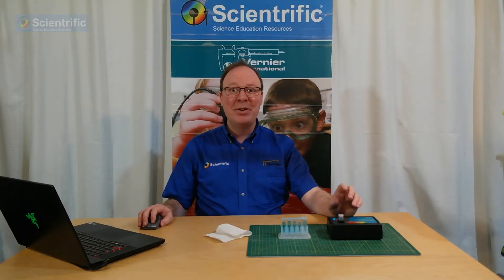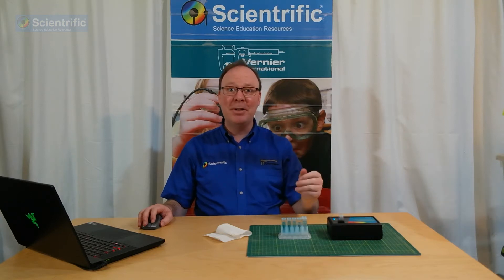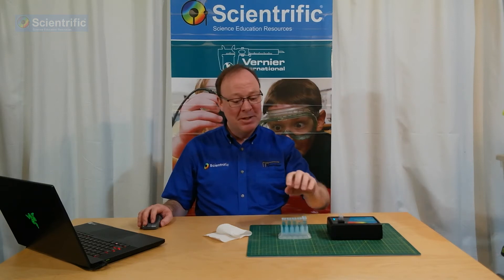In this case, we are going to be using water for our blank. I don't always use water though, depending on what I'm going to use it with. For example, if I was going to do a chlorophyll experiment, I would use alcohol instead of water. But for this one, I'm just going to be doing food coloring. This is a great one to do at home if you have a colorimeter or something similar, because you can look at the amount of food dye inside sports drinks. I'll actually attach some notes on how to make your own colorimeter at home.